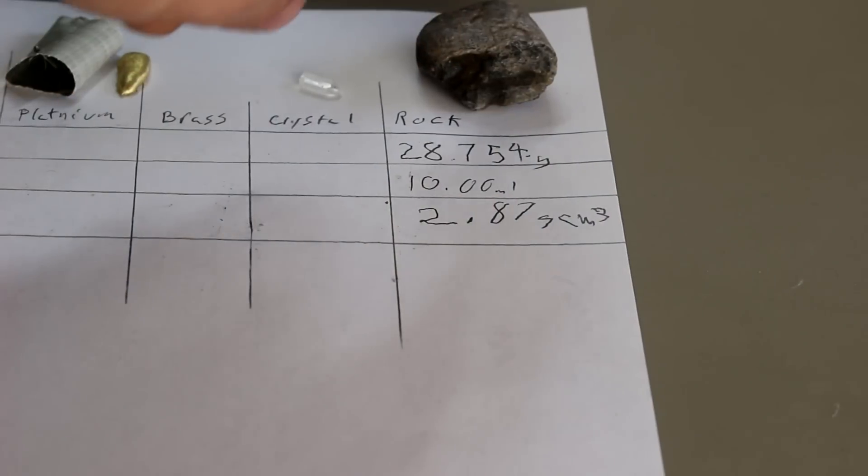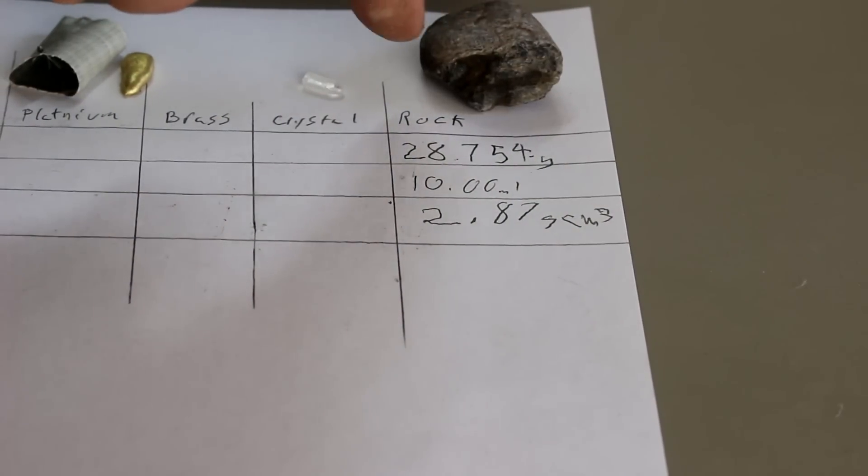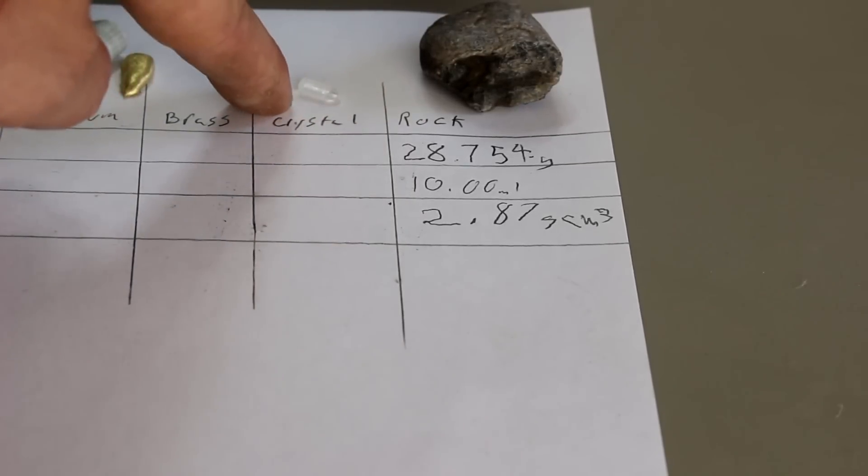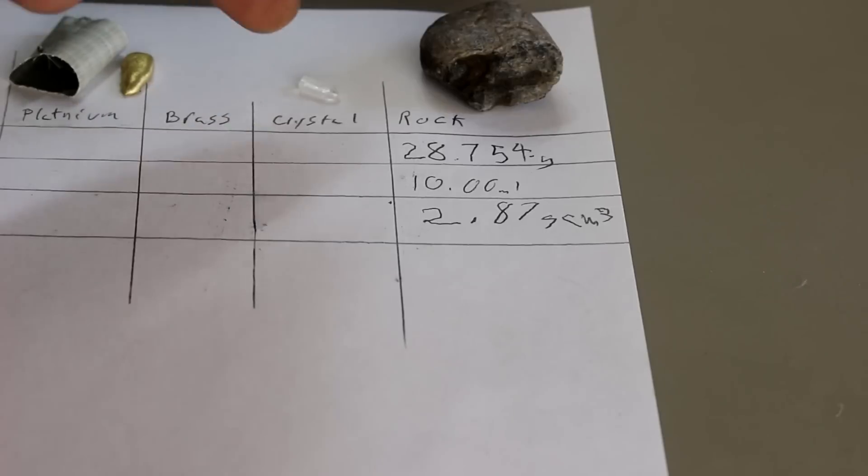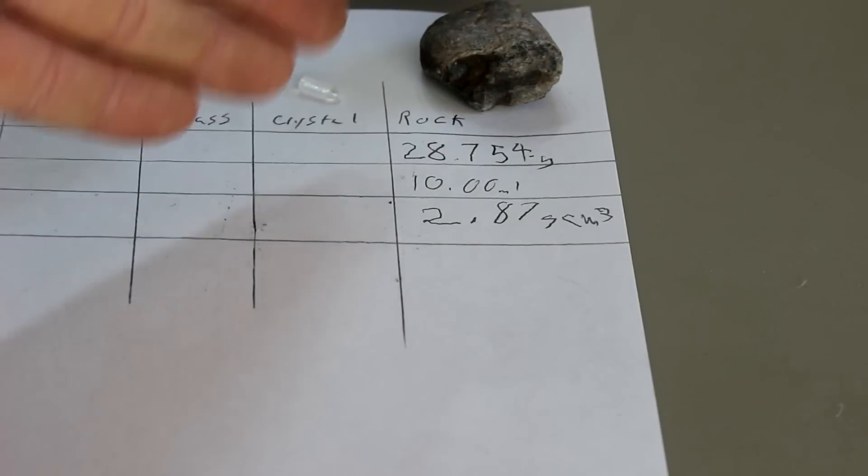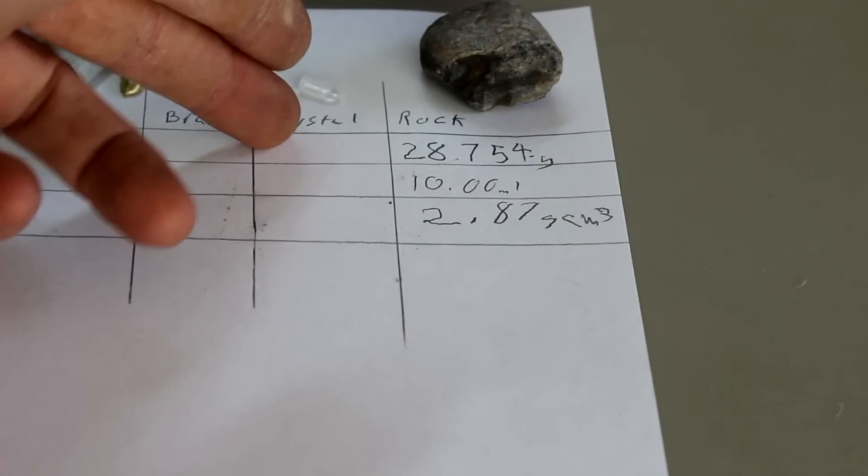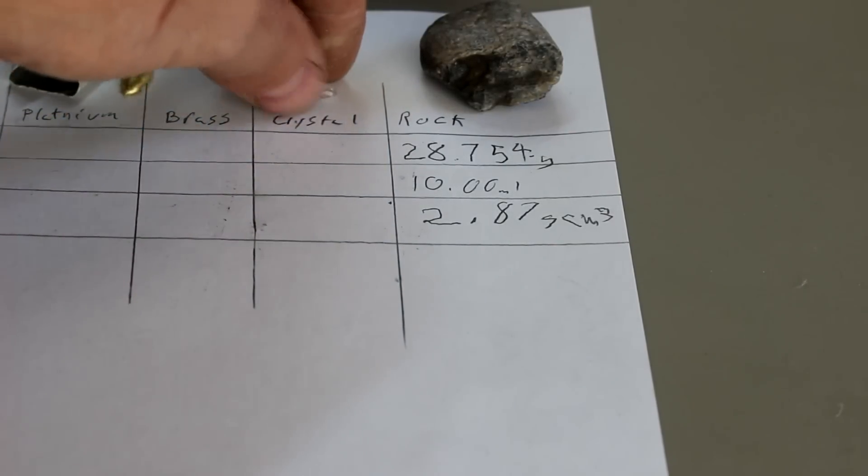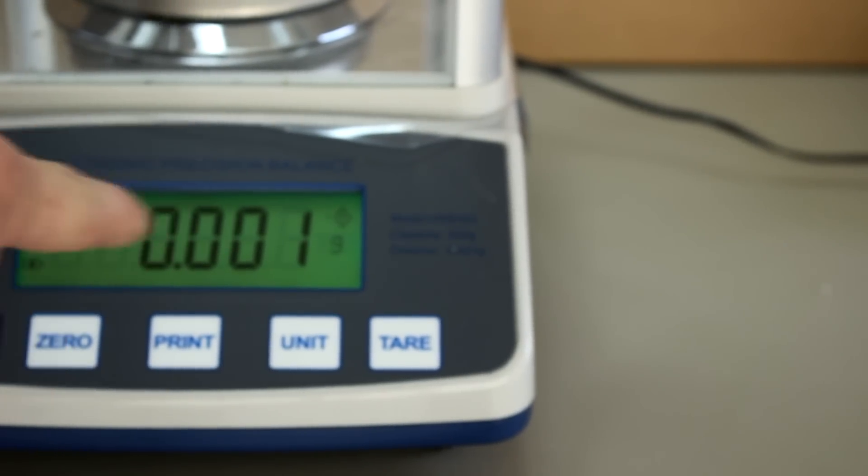Now what would happen if instead of a large rock you had to measure the density of a tiny crystal? You see for something this small you'd have to use a graduated cylinder with markings on the order of a hundredth of a milliliter. I know the university does, but I don't personally own a graduated cylinder that's that accurate. However, I do have a scale that can measure out to the milligram.